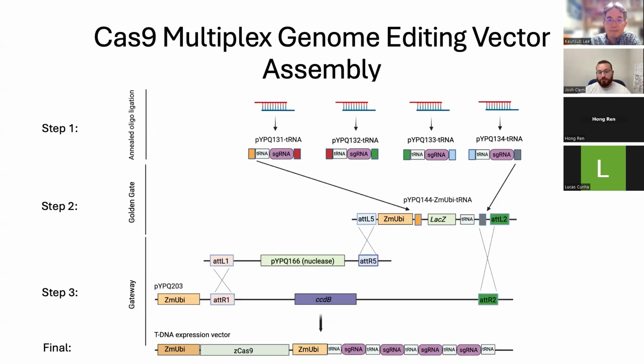In particular, you have aspects such as the chromatin accessibility, which we know has an influence on the efficiency of a particular guide RNA. Some parameters that I personally use, and by the way, I design almost all of my guide RNAs manually. I know that there are softwares out there that will help you to do it, but I use a few basic parameters. I try to keep the GC content between 40 to 80%. Ideally, I want to be around the 50 to 60% range.